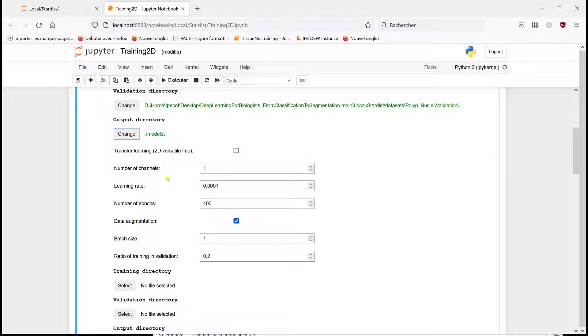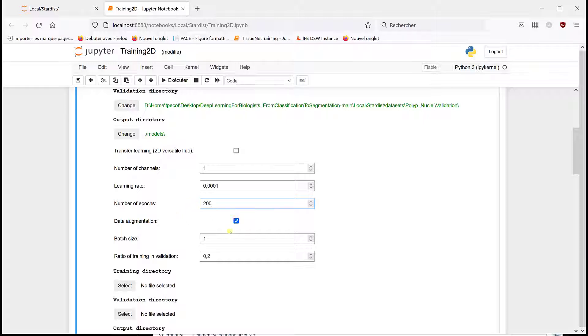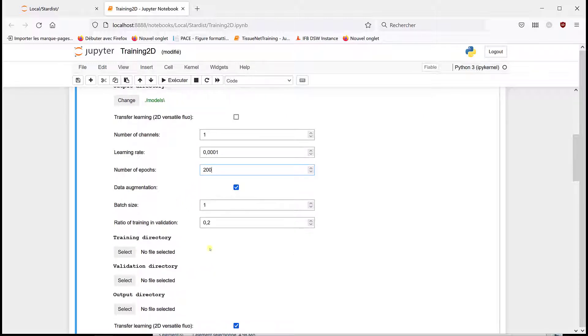We're going to do a learning rate of this value, and let's say just 200 epochs. You can choose to do data augmentation or not. We're going to do it because in that case it's a bit different.